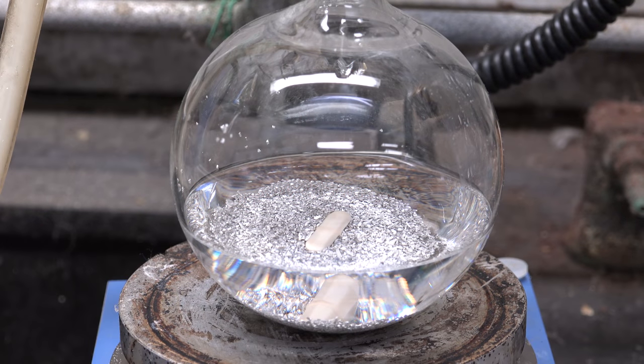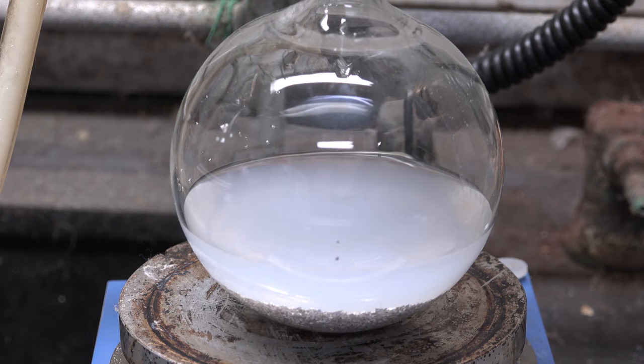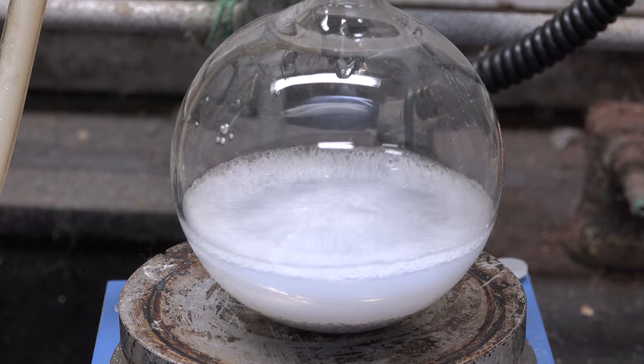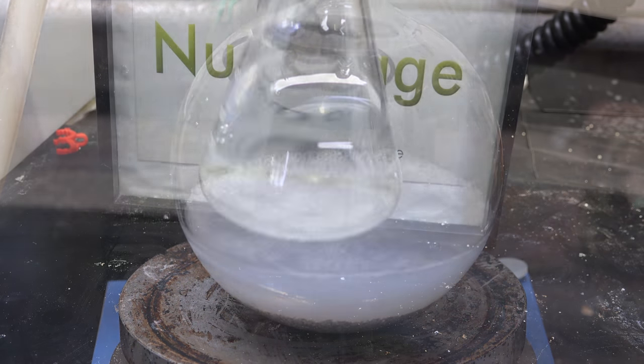Greetings fellow nerds. In an upcoming video I'm going to be making Grignard reagents and performing Grignard reactions. Grignard reagents are notoriously sensitive to water, reactive impurities, as well as air. So before we begin we need to dry and purify our solvent, diethyl ether. So here is our diethyl ether.